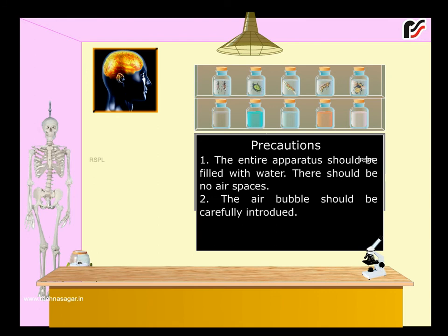Precautions. The entire apparatus should be filled with water. There should be no air spaces. The air bubble should be carefully introduced.